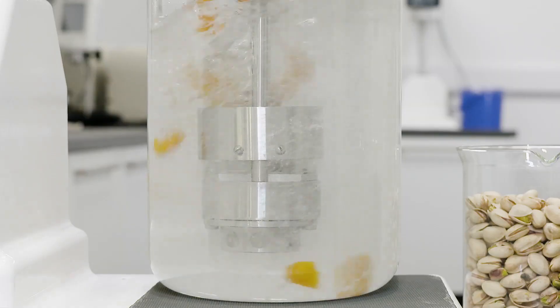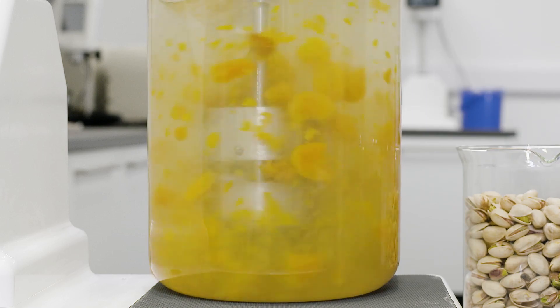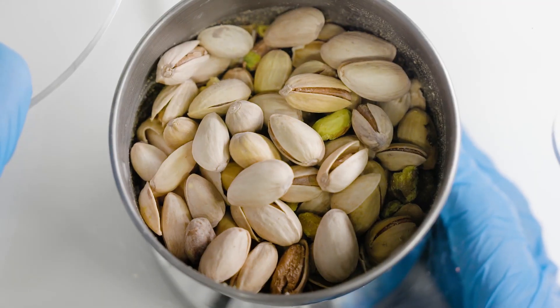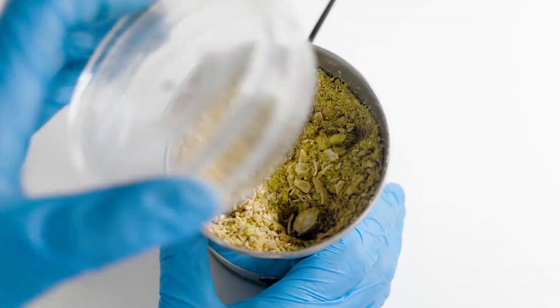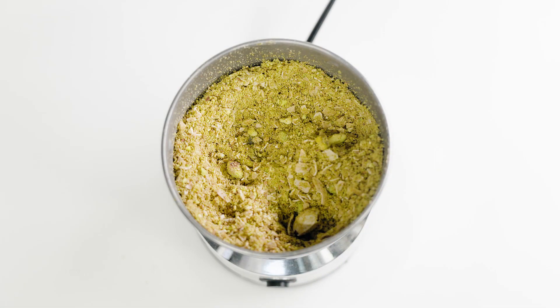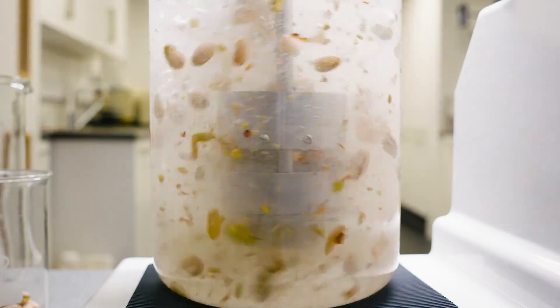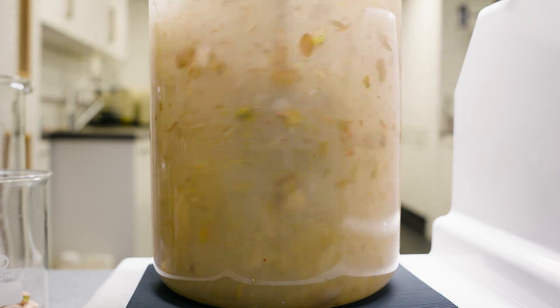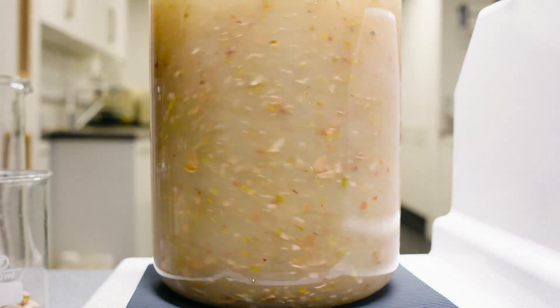Research has identified that preparation of samples by slurrying offers significant advantages over dry milling. For example, the heat generated by dry milling can degrade the aflatoxin, distorting results. This problem is eliminated by slurrying the sample in water. High shear mixing can also provide a more uniform particle size and improved batch-to-batch consistency.